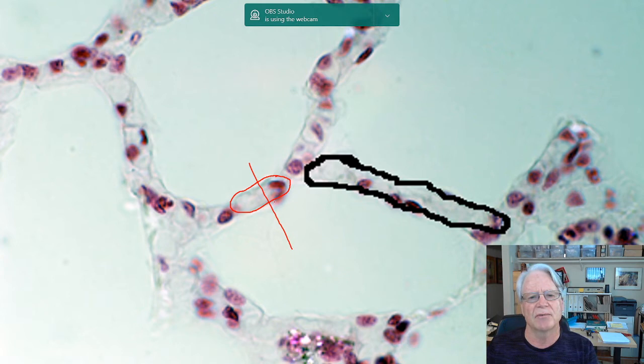You can't see it, but there'd be a little blood vessel right here, and oxygen would be moving from this area into the capillary, and then carbon dioxide would be moving out into this space here. So this would have oxygen in it here, and carbon dioxide.